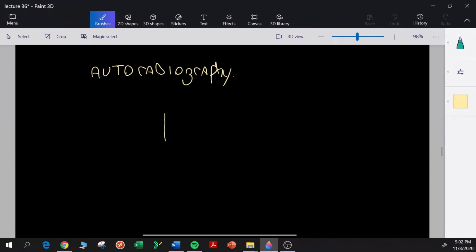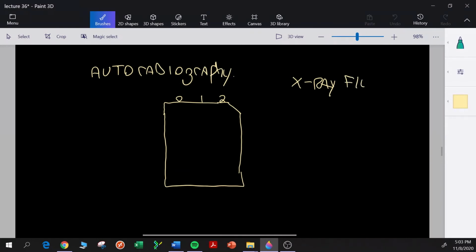So let's say we take the nylon membrane out of the hybridization buffer, and there are some washing steps we need to do to rinse off excess probe that's not stuck to any of the messenger RNAs, but we can ignore those. So let's say this is lane 0, lane 1, and lane 2. And what we need to do now is put a piece of X-ray film on, working in a dark room with a light that won't damage the X-ray film. We put the film over the nylon membrane, which is damp, so we probably wrap it in a piece of saran wrap. And that doesn't bother the beta particles, they go right through the saran wrap.